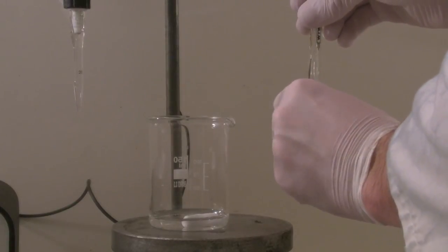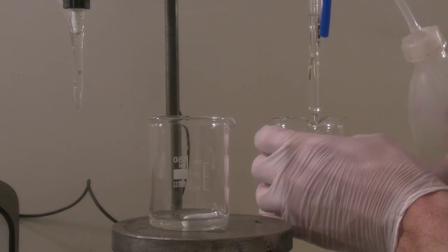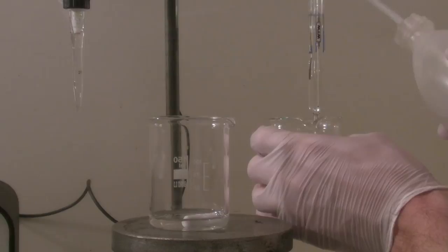Just before the measurement, the cap was removed from the electrode. The cap contains the reference electrolyte to keep the electrode from drying out, which has to be washed off with distilled water.